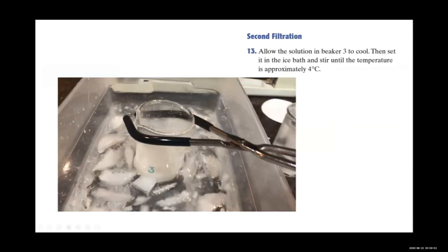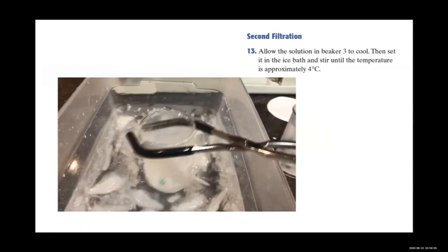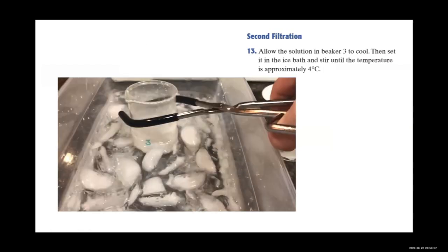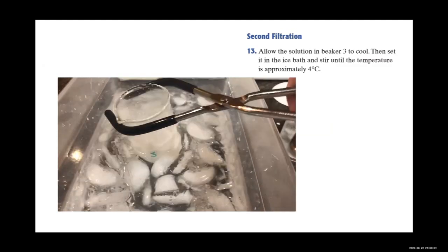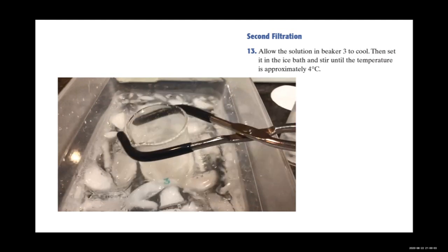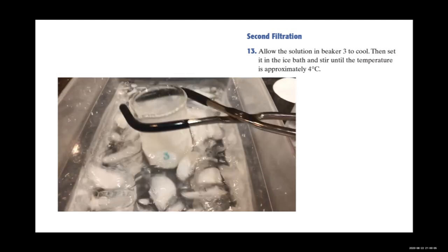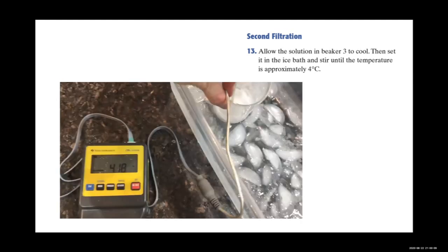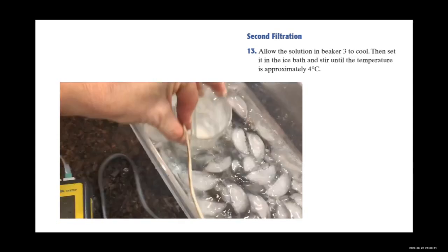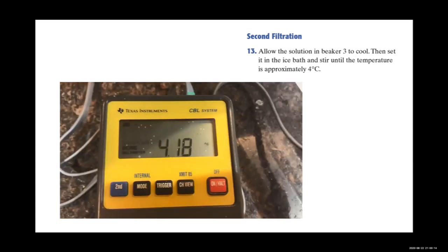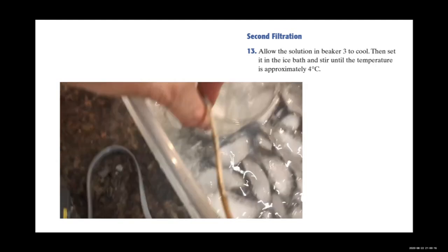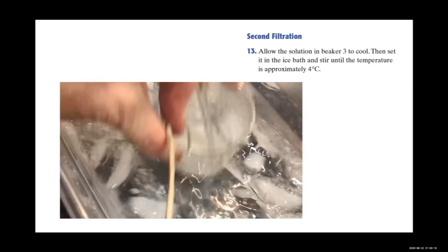For the second filtration, allow the solution in beaker 3 to cool, then set it in the ice bath and stir or swish it again until the temperature is approximately 4°C. You'll notice that the remaining solution is much thicker this time — more like a slurry.